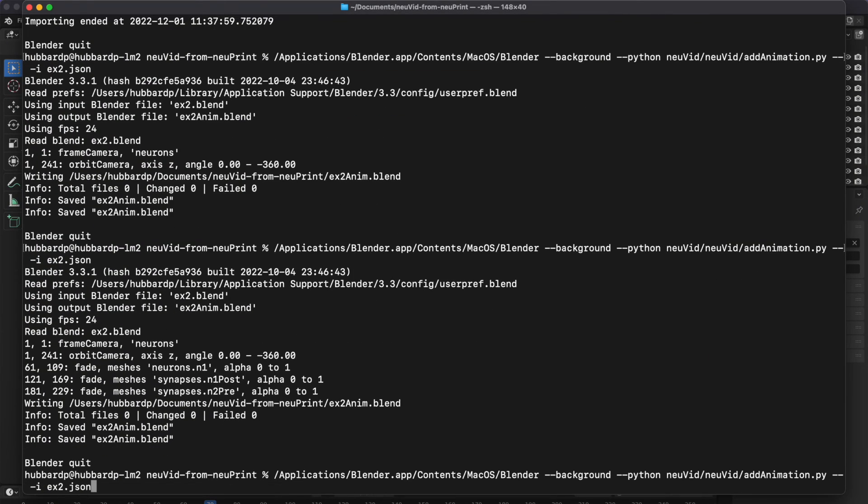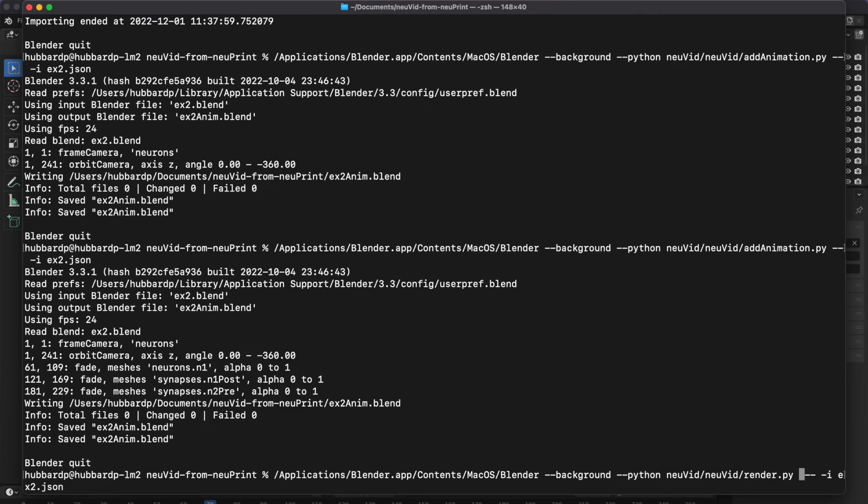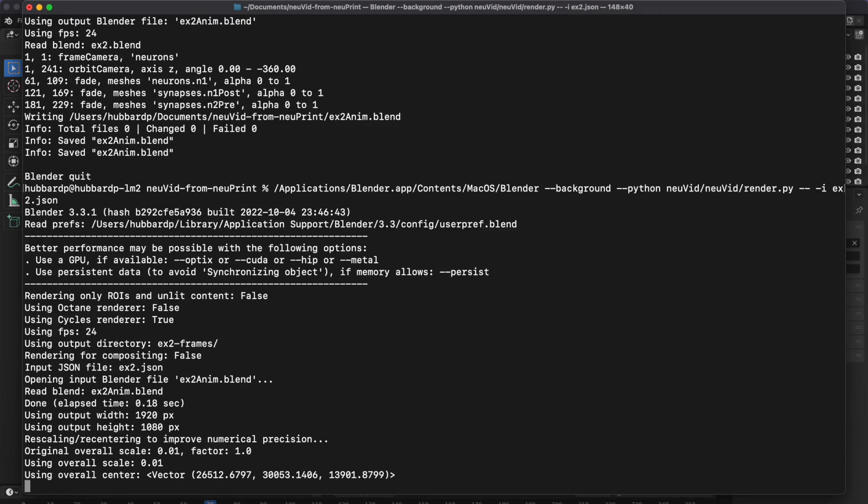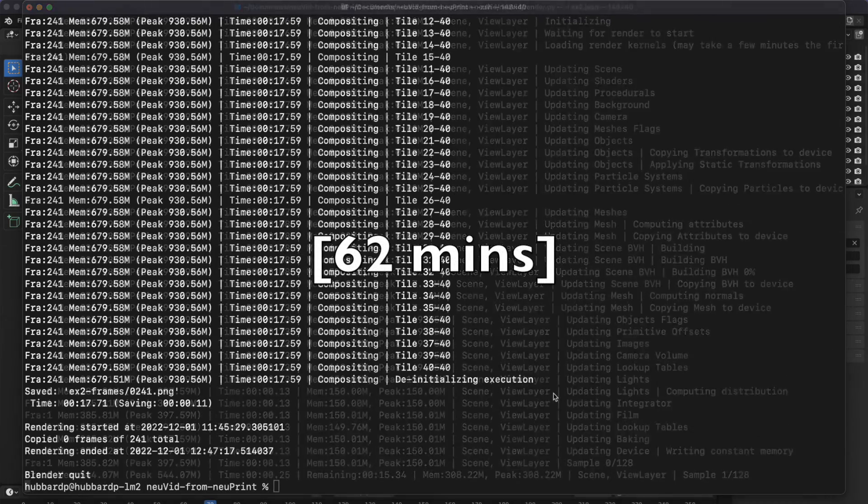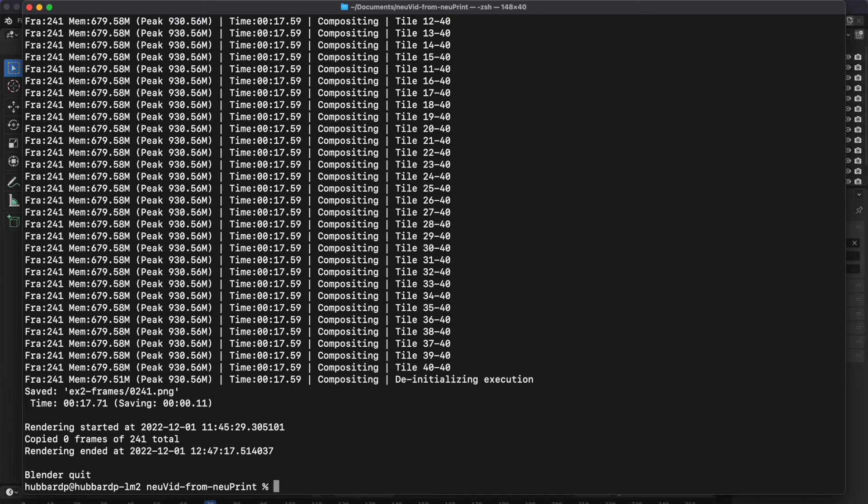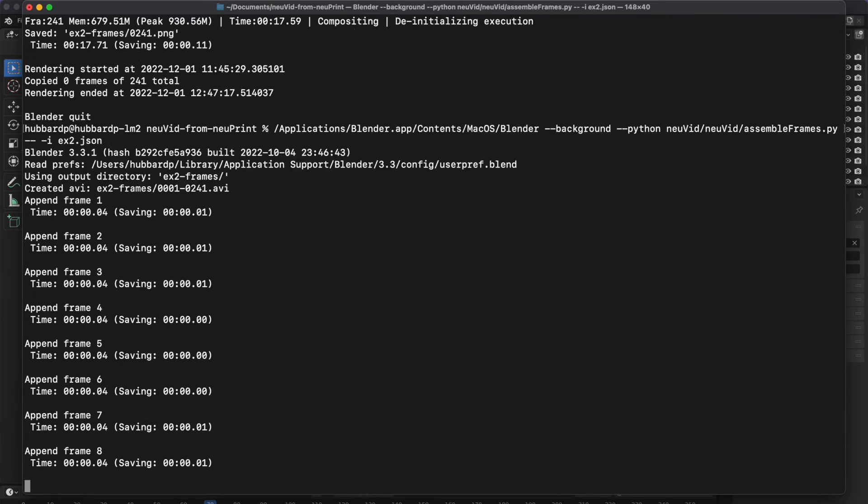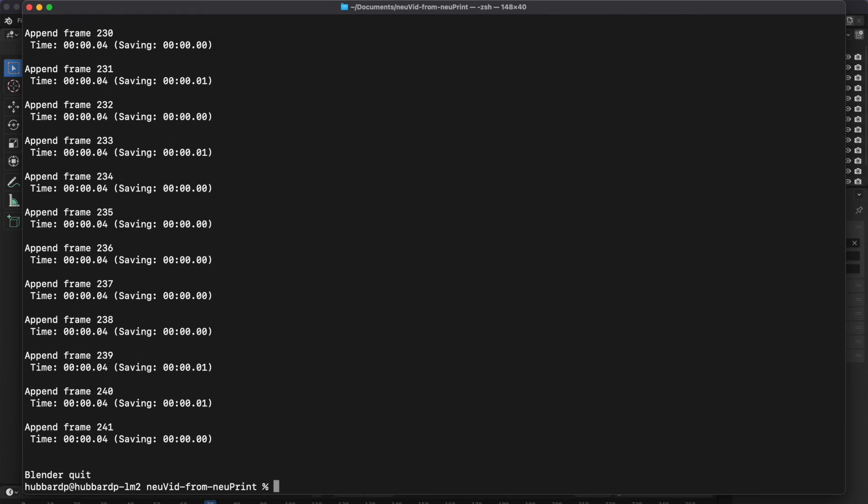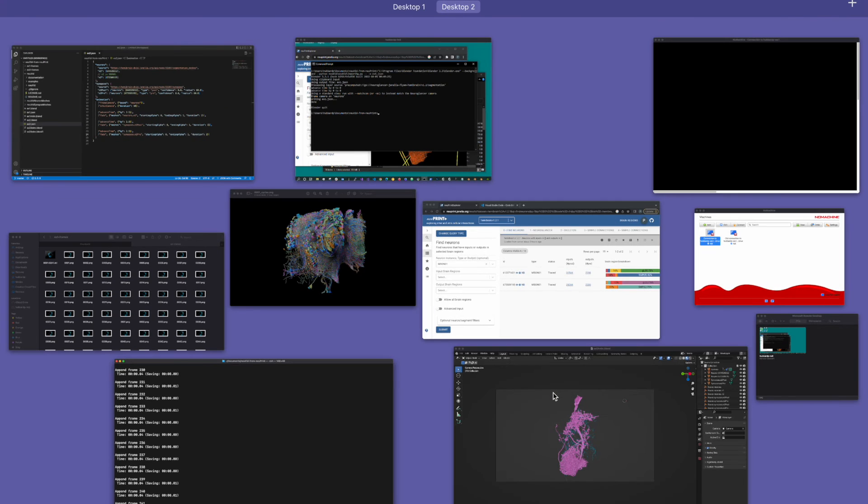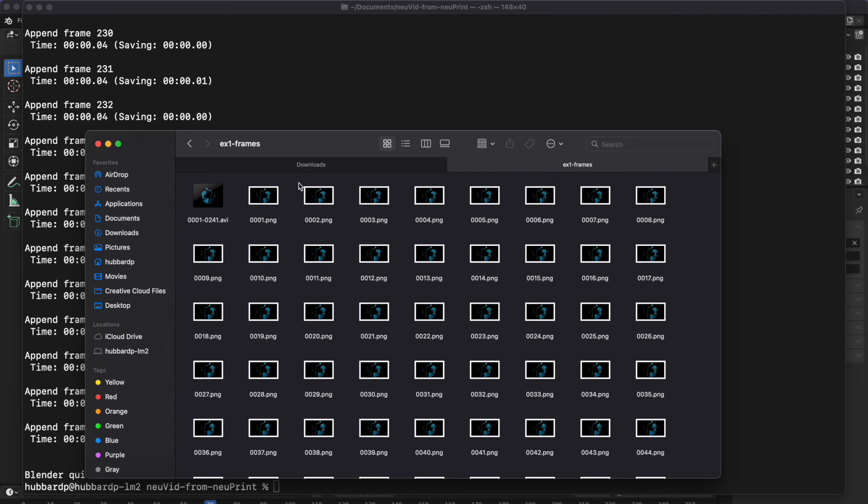And now all we need to do is render it. When the rendering is done, we can assemble the frames again. And then we can go take a look at the video.